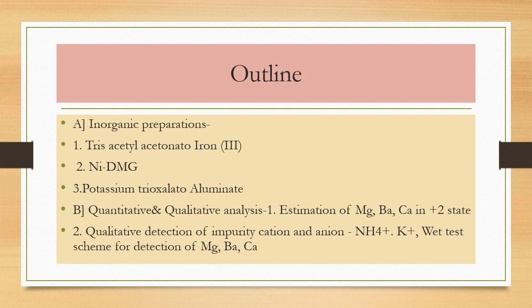The first part is inorganic preparations, a total of 3 preparations included in your syllabus, and the second set is quantitative and qualitative analysis. The 3 preparations included are tris acetylacetonato iron(III) complex, the second one is nickel dimethylglyoximate complex, and the third one is potassium trioxalato aluminate complex. All three are coordination complexes.